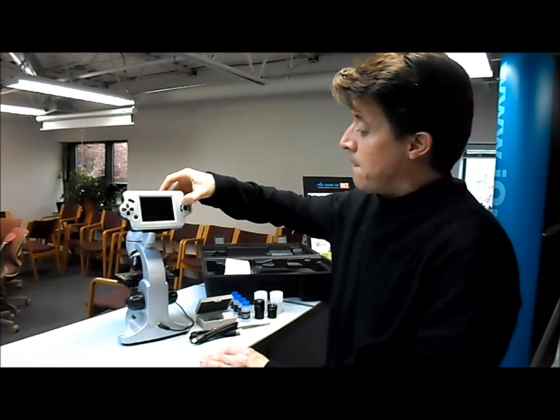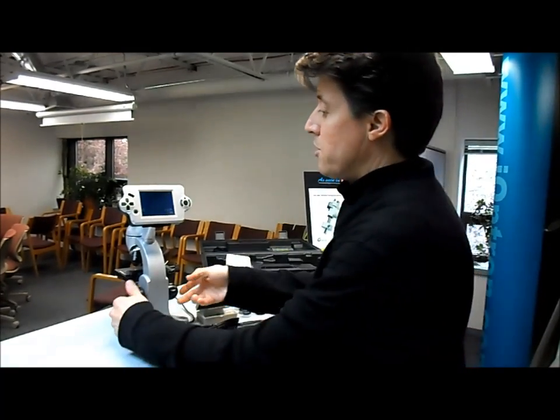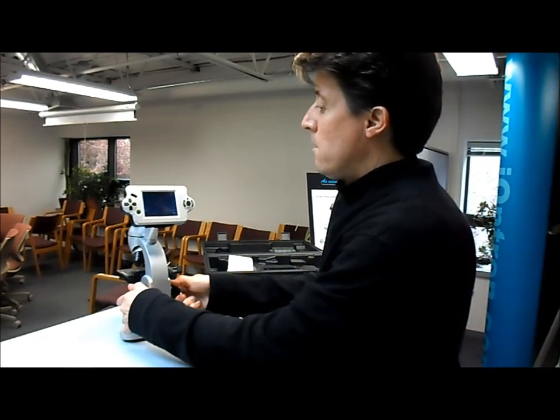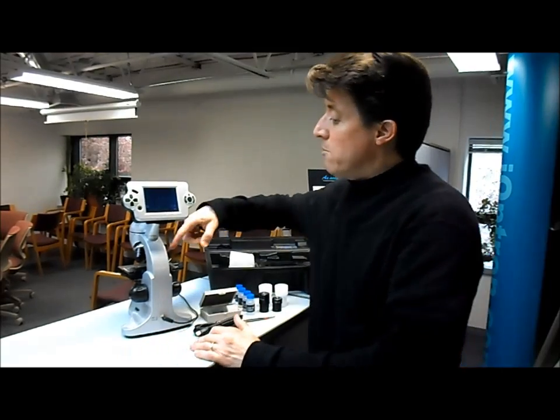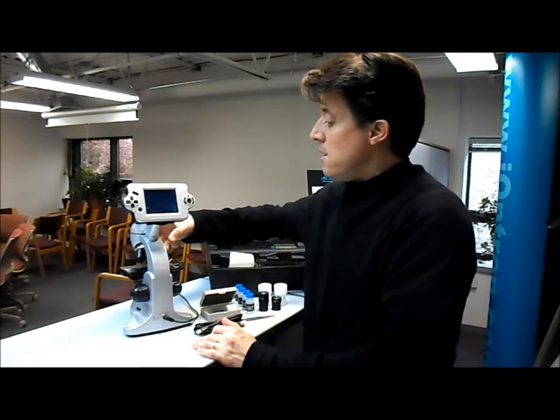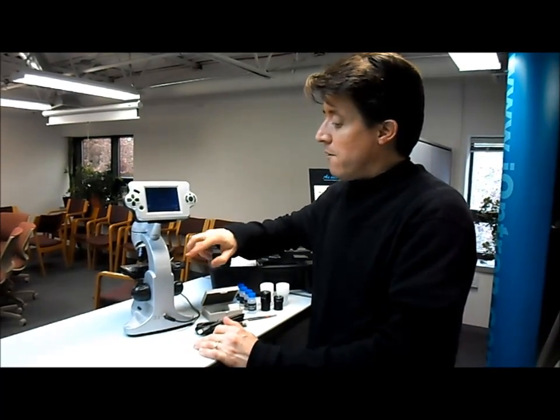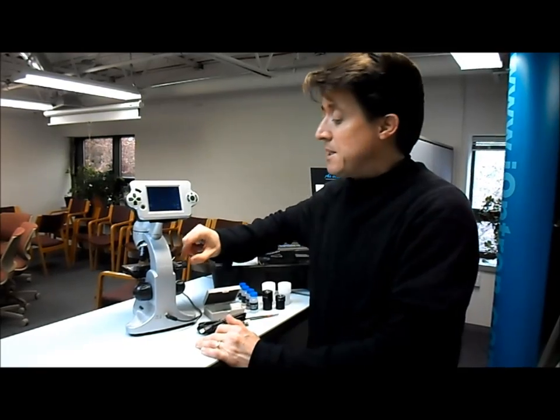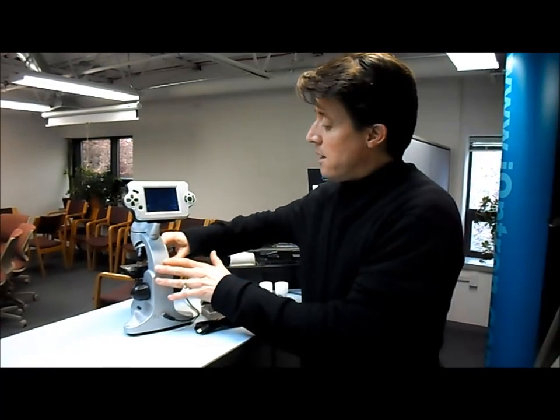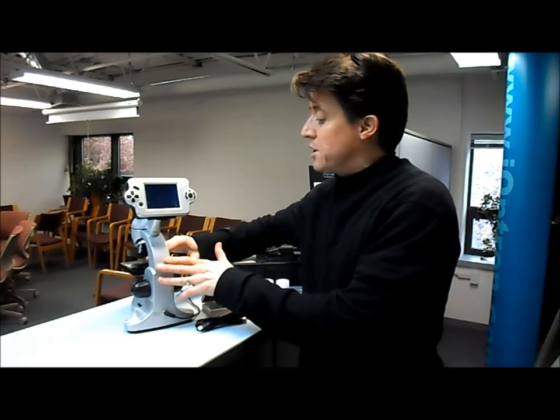I'm going to turn this on and adjust the focus here. This comes with three objectives: a 4x, a 10x, and a 40x. Right now I have it set for 4x. It has different features — I have an XY axis on the table, I can also adjust the focus, and it has a little spot where I can hold and secure the specimen slide.